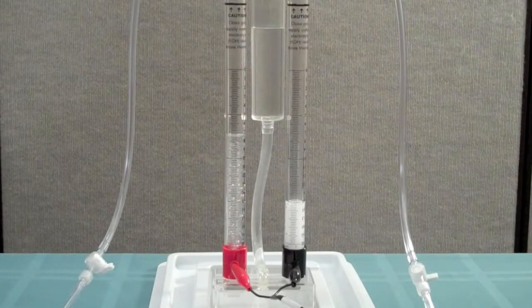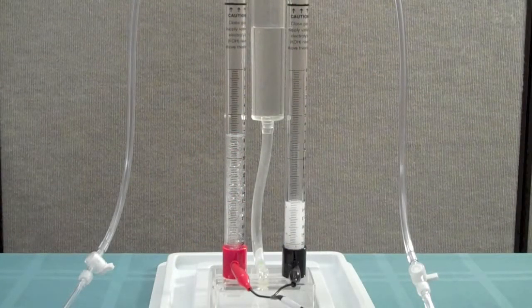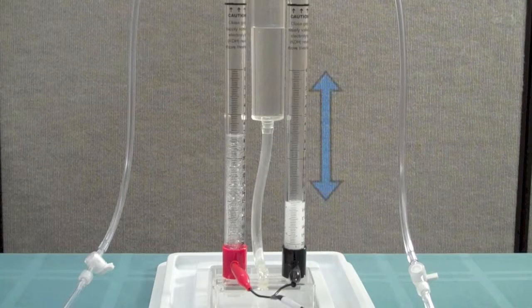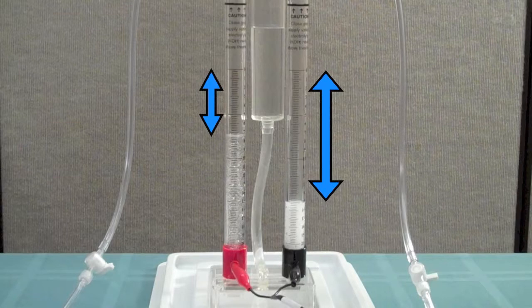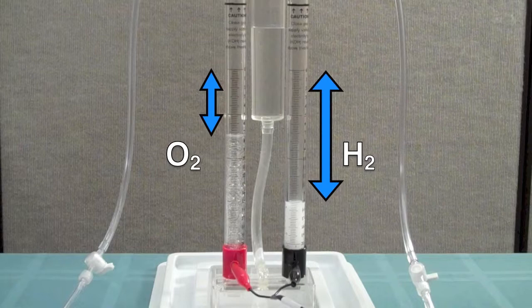Second, we can observe the volumes of the gases produced. As the electrolyzer stores the gases, you will notice that the black storage column has twice as much gas stored as the red column. Again, since two hydrogen molecules are produced for every one oxygen molecule, the black side must be storing hydrogen.